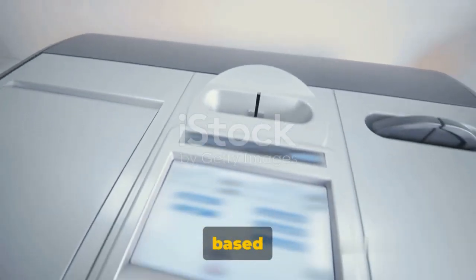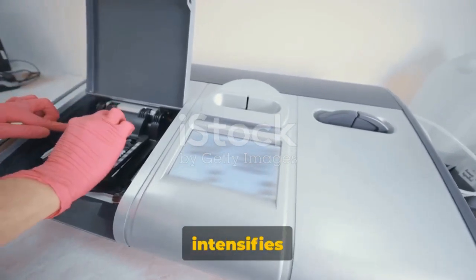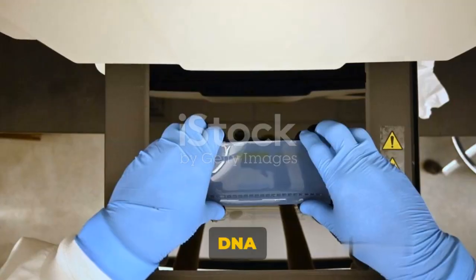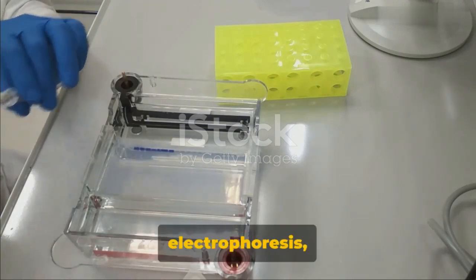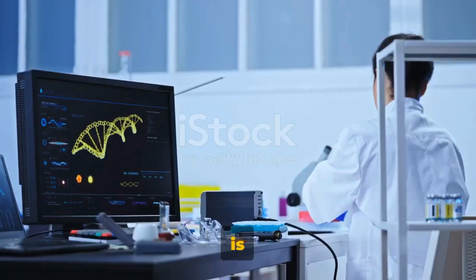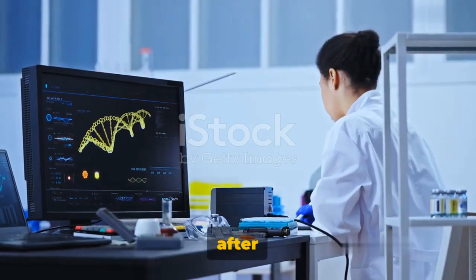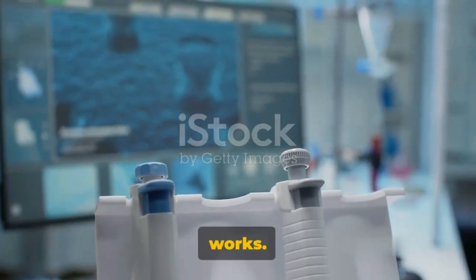The process is based on the detection of fluorescence produced by a reporter molecule, which intensifies as the reaction proceeds. This technique is a powerful tool in molecular biology, allowing for the exponential amplification of DNA sequences. Unlike conventional PCR that requires post-reaction analysis using gel electrophoresis, real-time PCR saves time by providing analysis during the process. This is where the term real-time stems from, signifying its ability to monitor the amplification process as it happens rather than after completion. Now that we know what real-time PCR is, let's understand how it works.